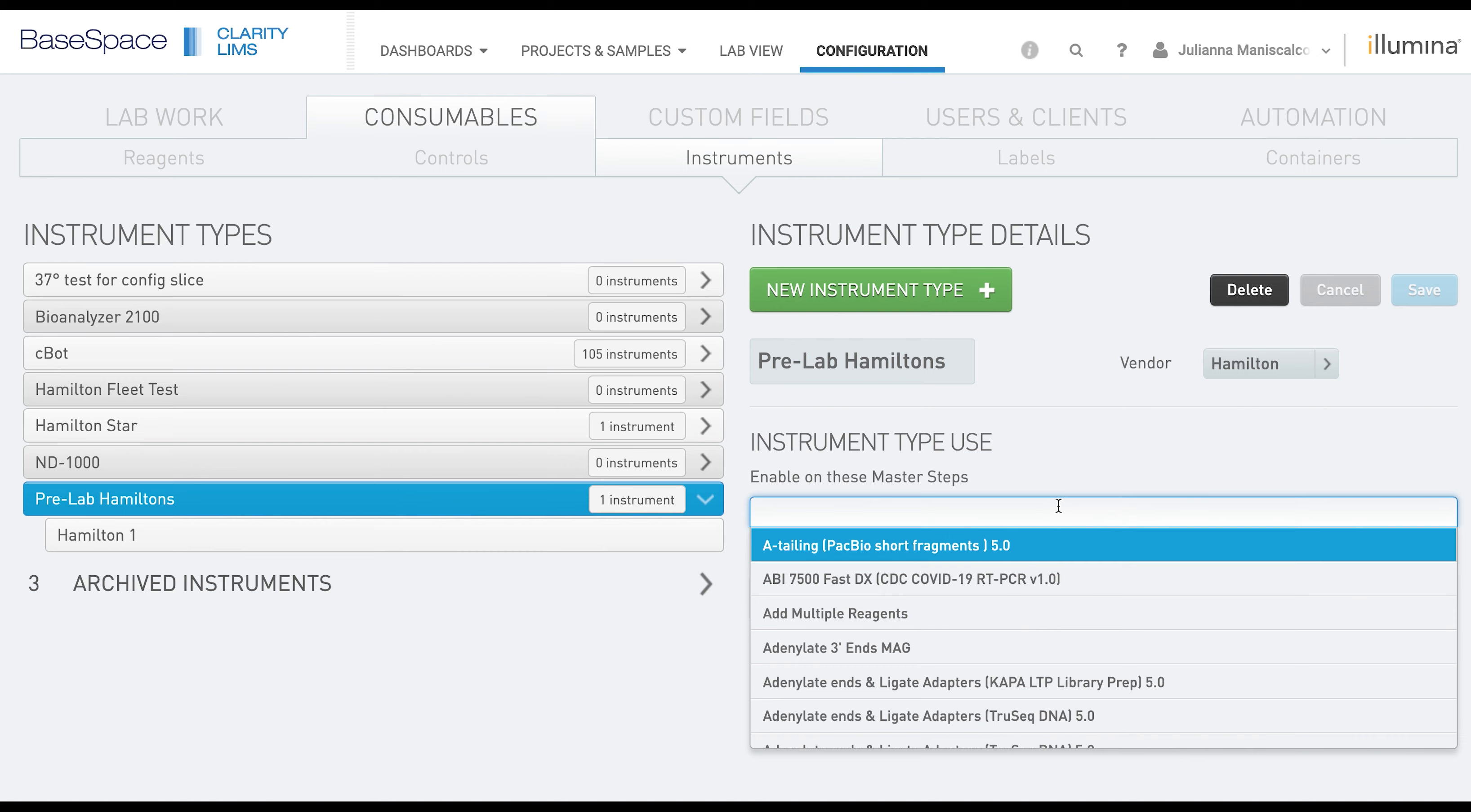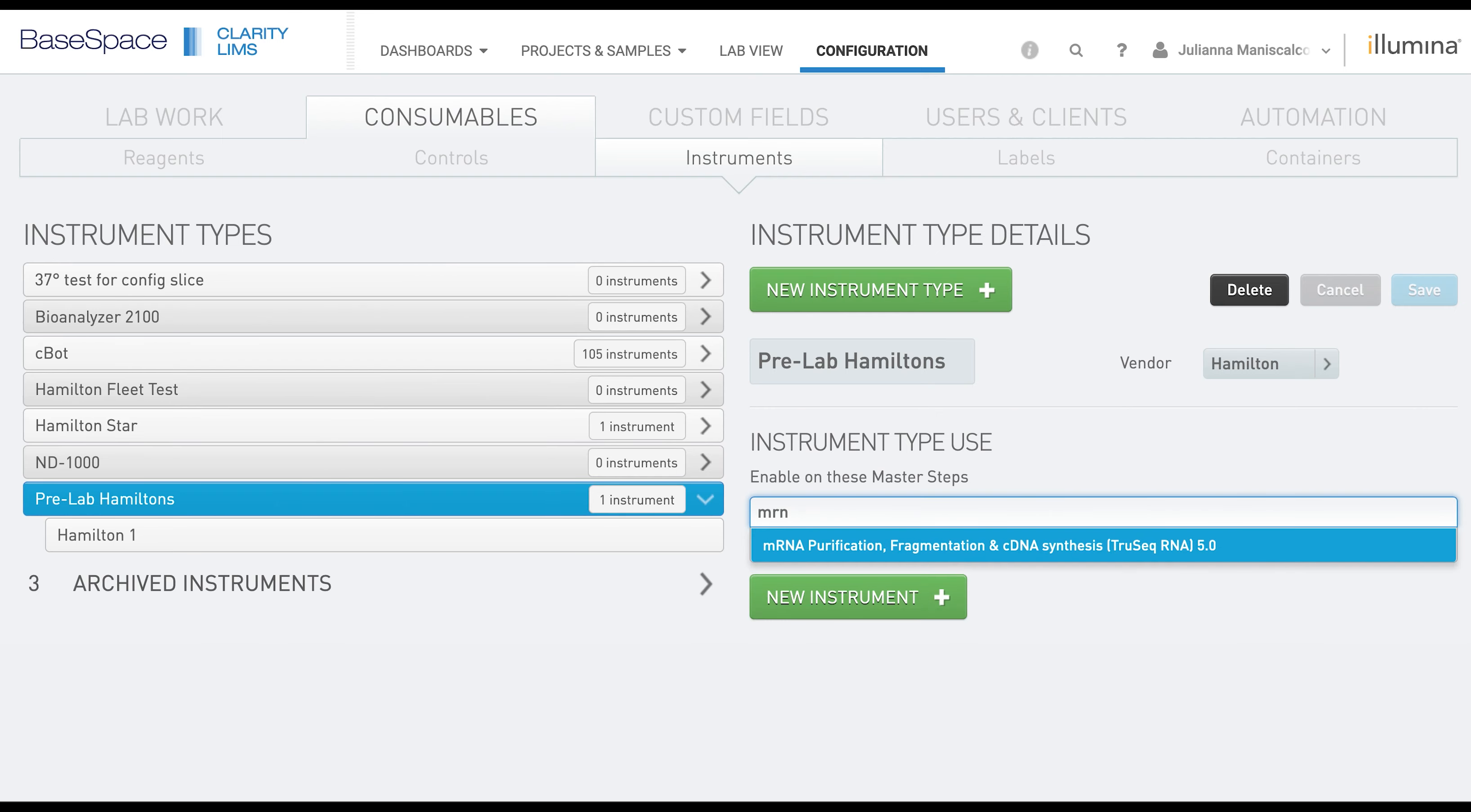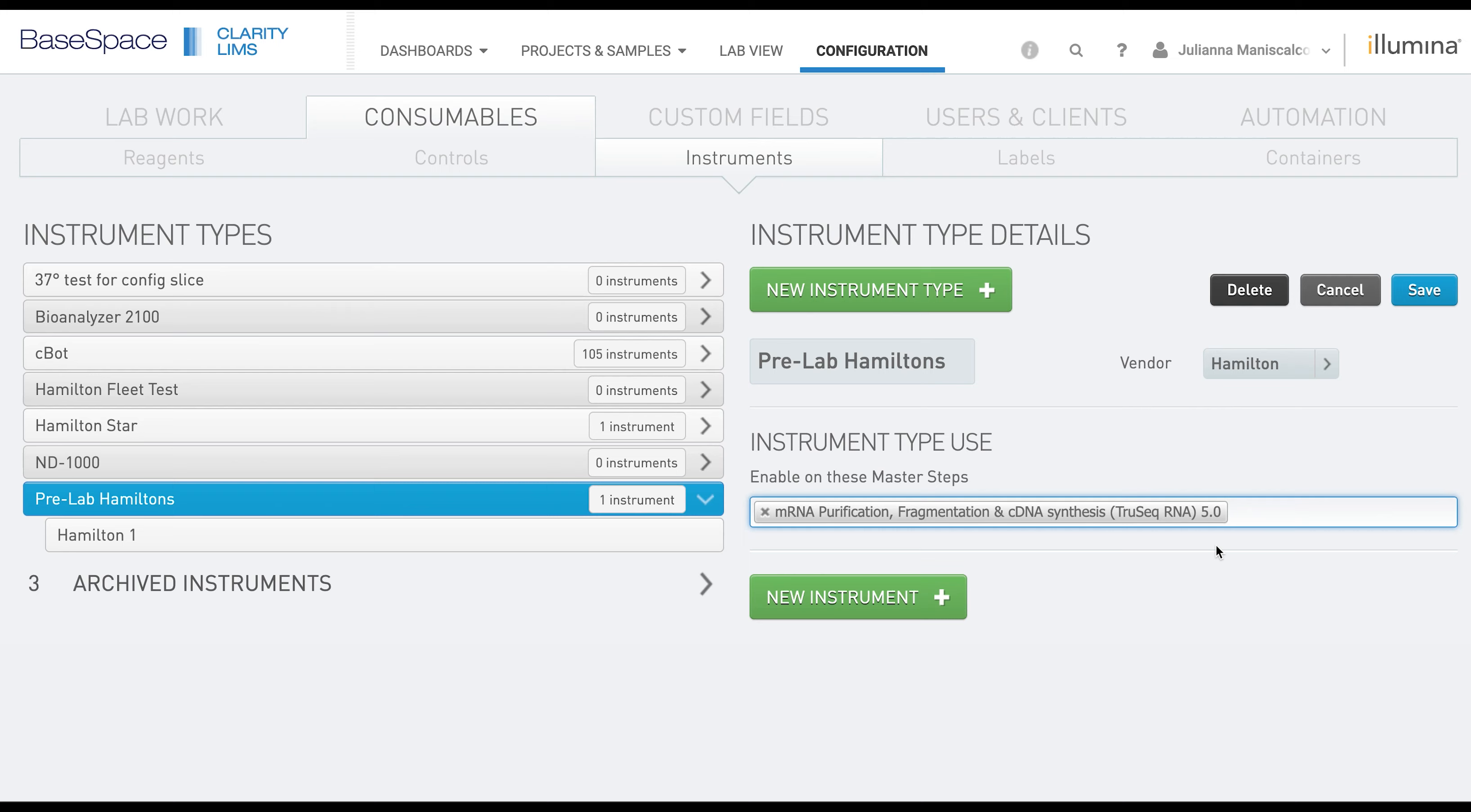We're going to associate this Hamilton fleet with the mRNA Purification and Fragmentation step, and then click Save.